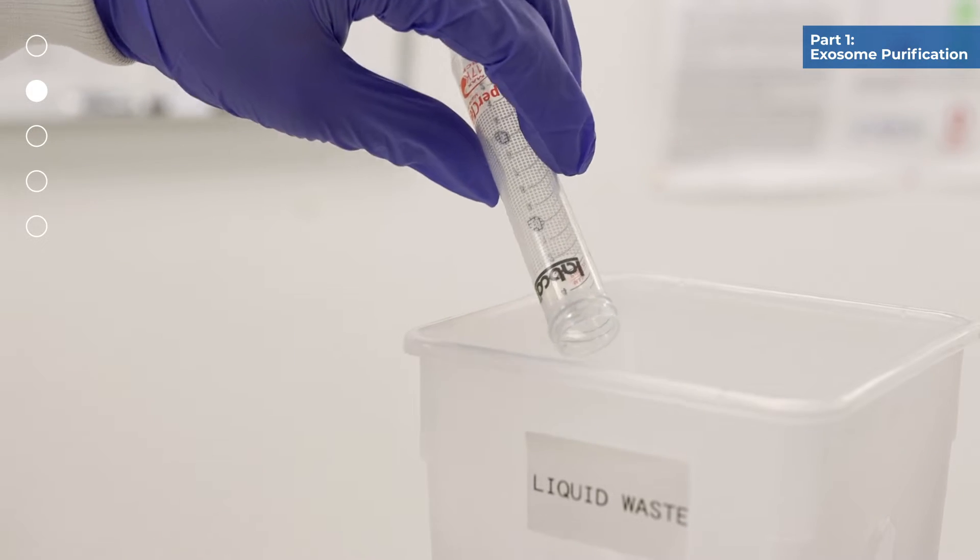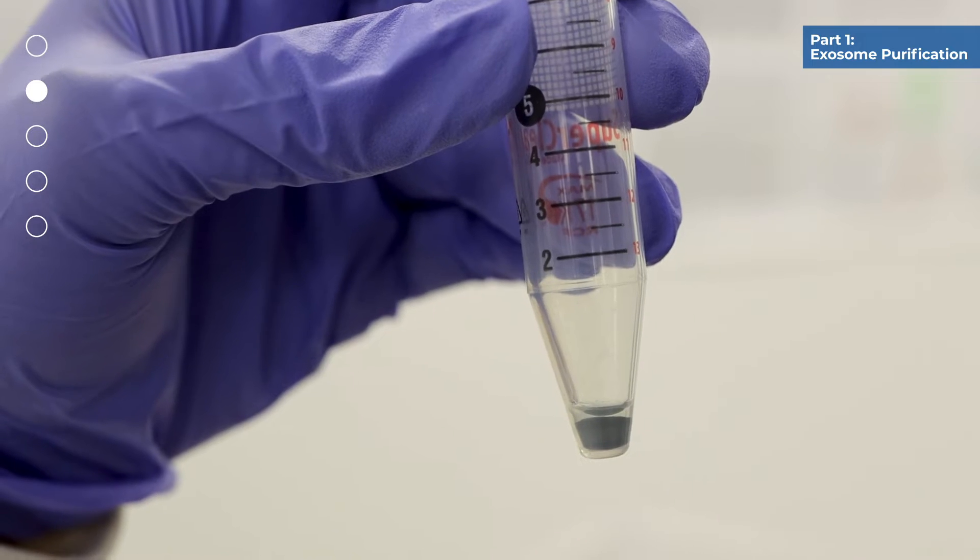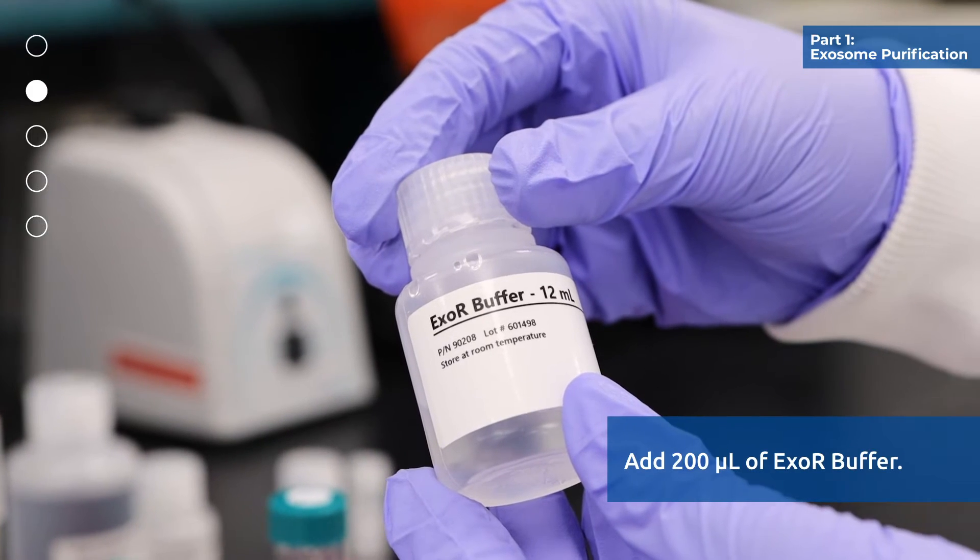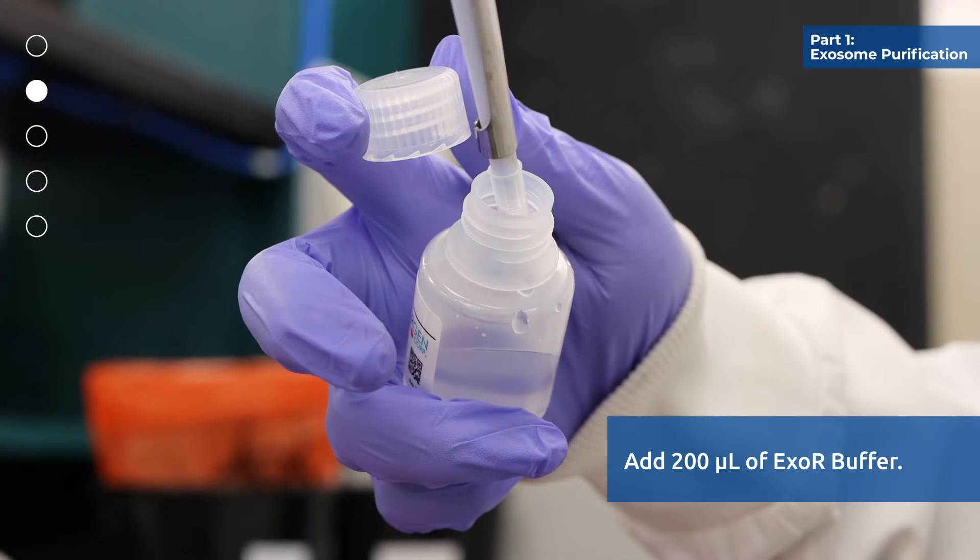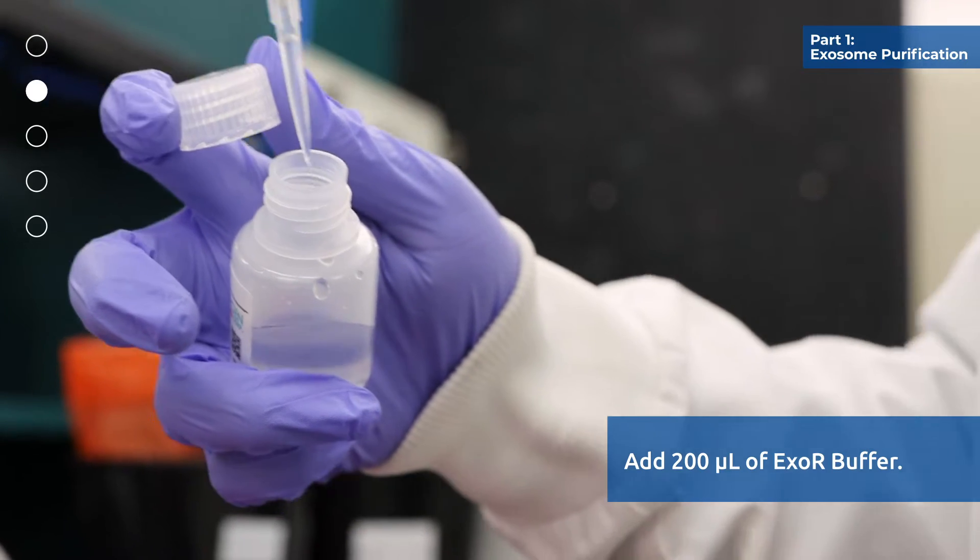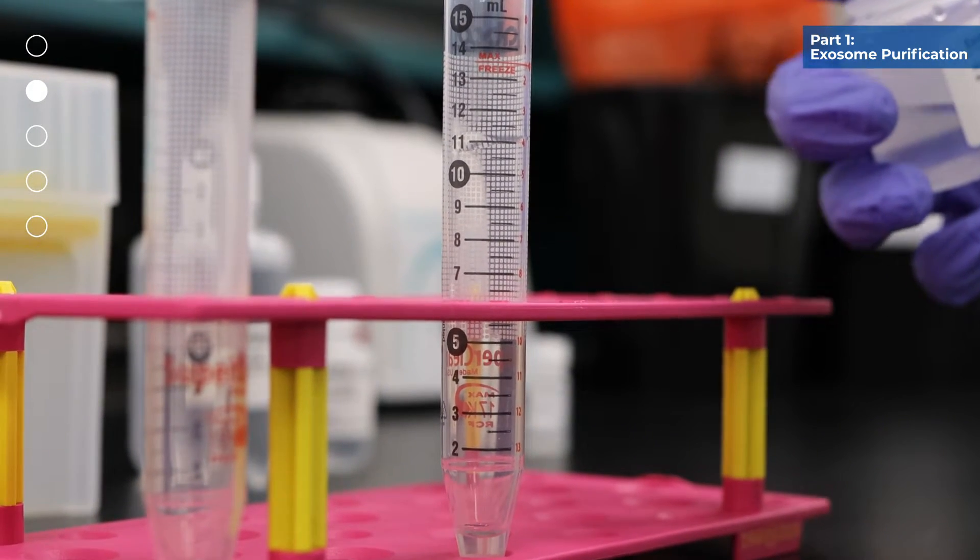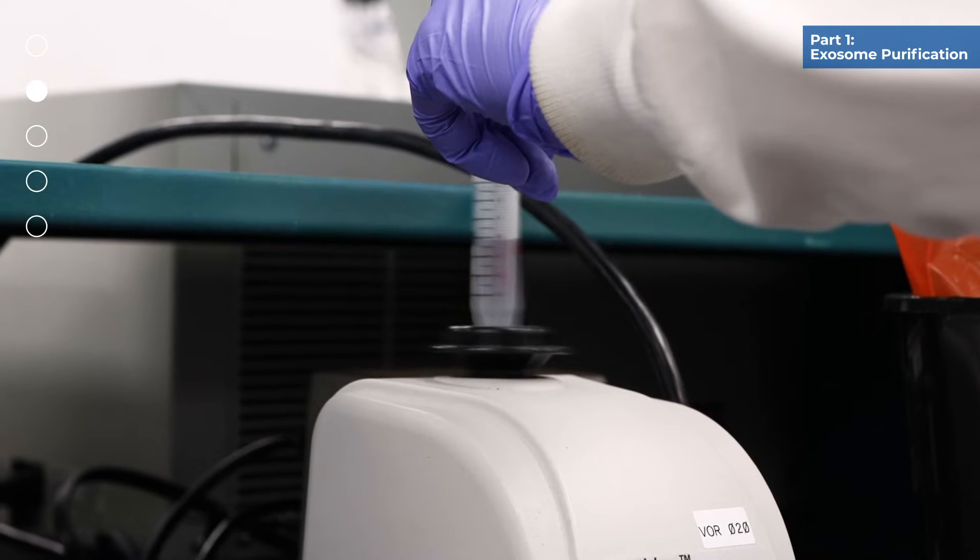Discard the supernatant. Apply 200 microliters of exo R buffer to the slurry pellet and mix well by vortexing for 10 seconds.